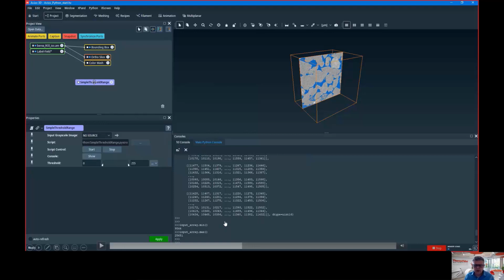And when the code looks nice, you copy it into the PyScript. And the PyScript, of course, should be more generic than your code here, but that's the idea. So let's suppose you write the right code, you get this module, and basically you're done.